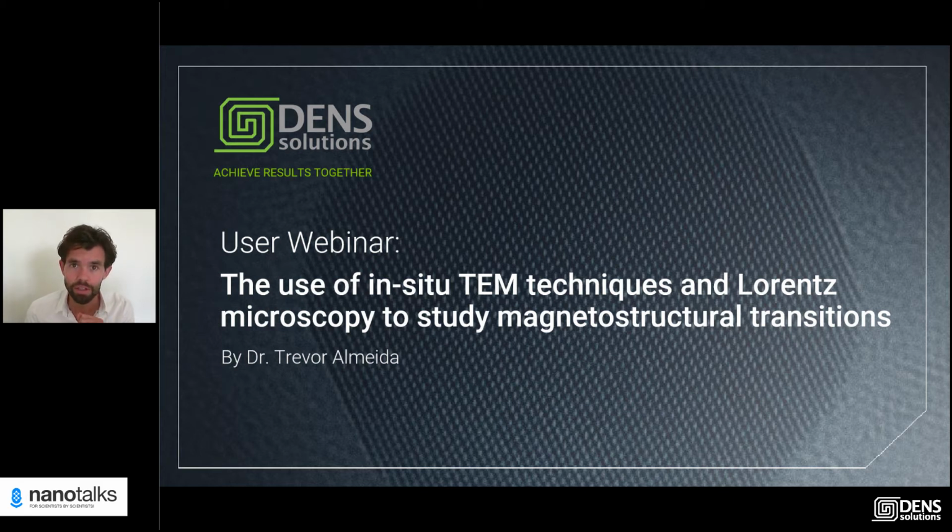This Nanotalk is a recording of a Lightning user webinar with Dr. Trevor Almeida, who uses in-situ biasing and heating simultaneously to investigate the magnetostructural transition and current-induced domain wall motion in iron-rhodium thin films. Now we will switch to the recording.